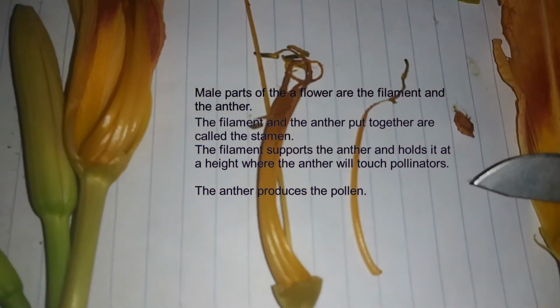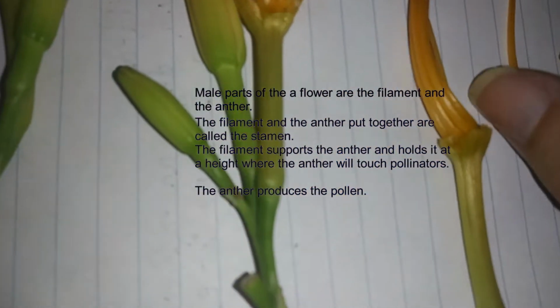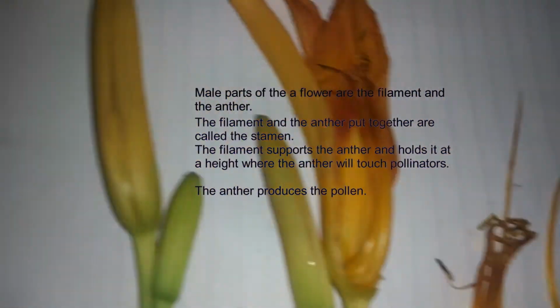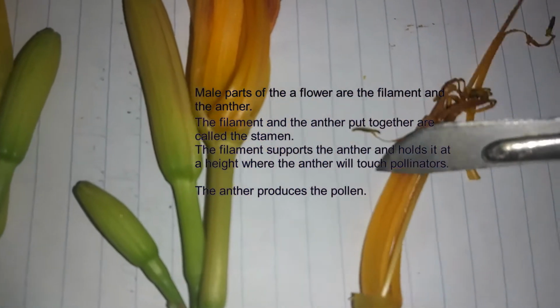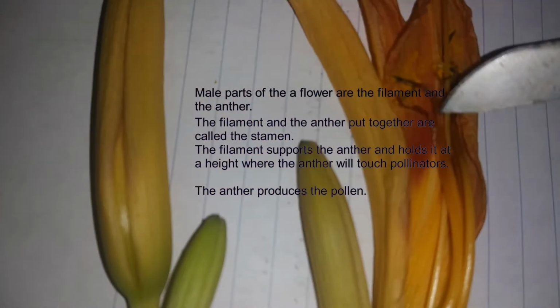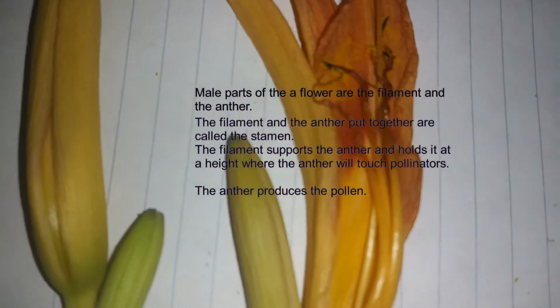Okay, so these long things right here are the male parts of the flower.